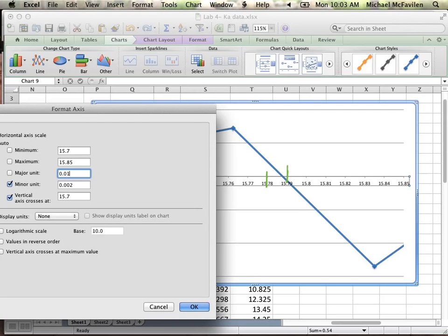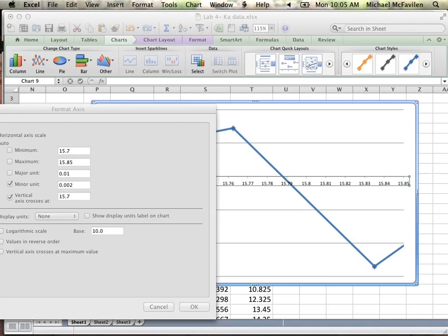So do you want us to report the equivalence points for each graph? You should report them for each graph. You will not have to calculate for each equivalence point. So you'll just pick the one that you think is the best, and that will be the one that you will calculate. Okay? So at this point, I kind of want to open it up to questions about what's shown up here before moving on with any of the calculation.